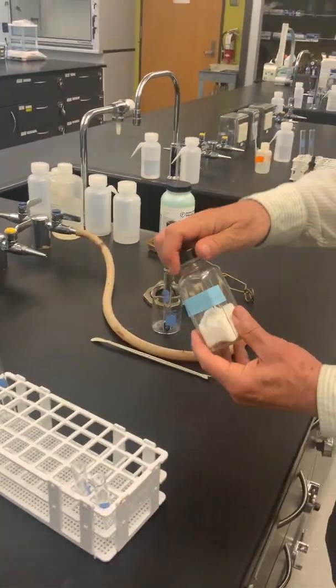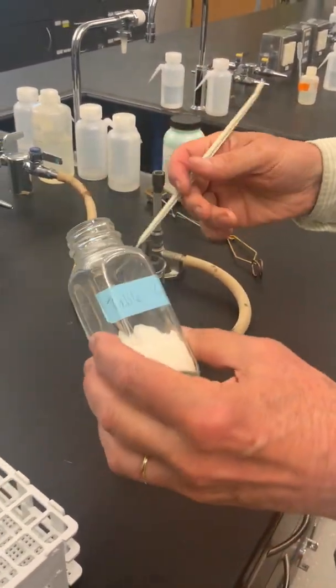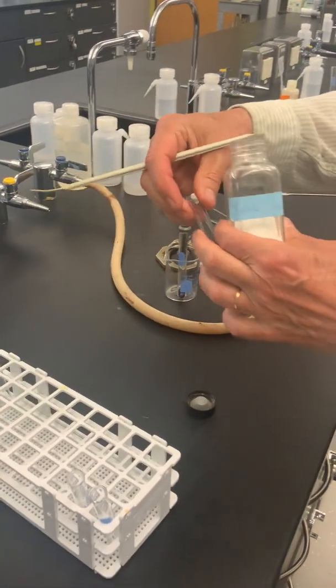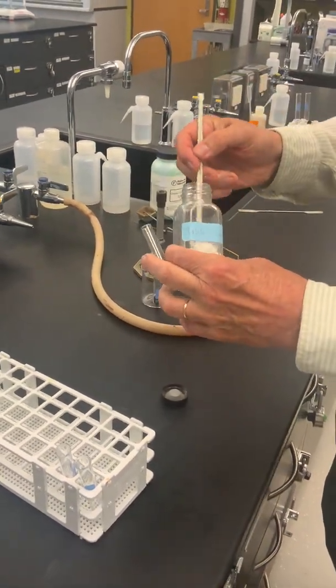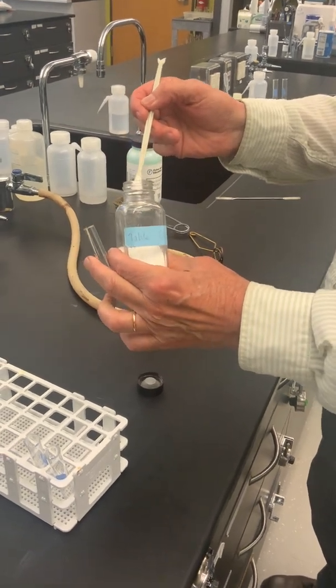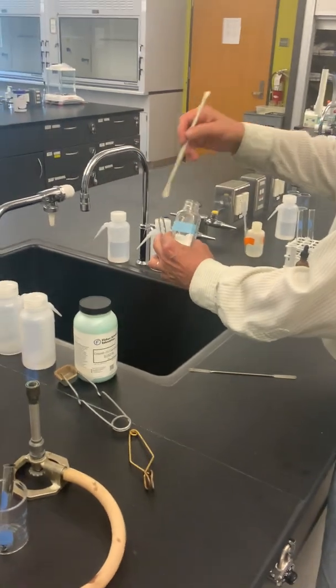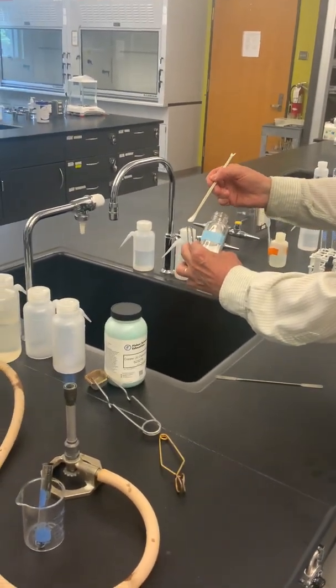In this case, your old friend, sugar, sucrose, which is a disaccharide. We'll talk more about carbohydrates as an important class of biomolecules. Again, moving over here, since I've got a bad scooper, I'll do this over the sink.